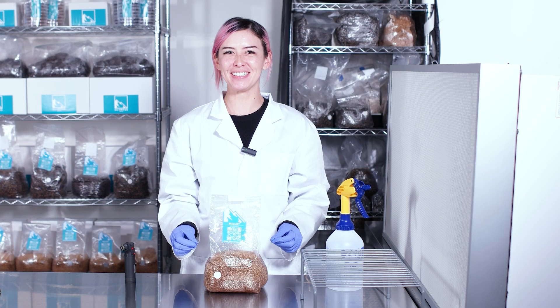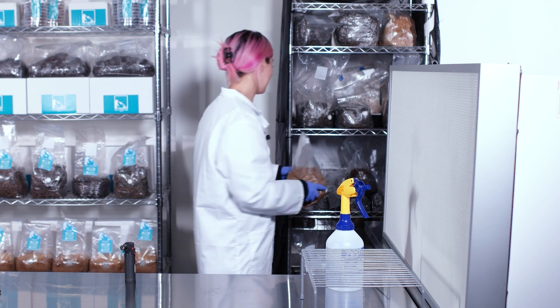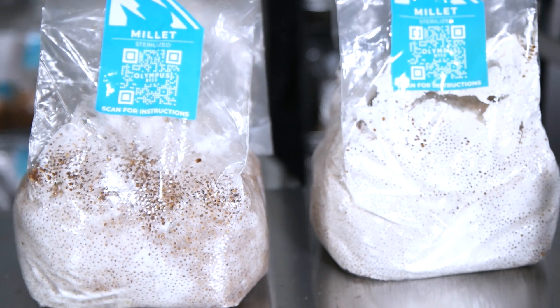Now we gotta give our little mycelium friends the perfect environment to grow in. Find a dark spot away from direct sunlight and let the colonization begin. You'll see those beautiful white tendrils spreading through the grain.